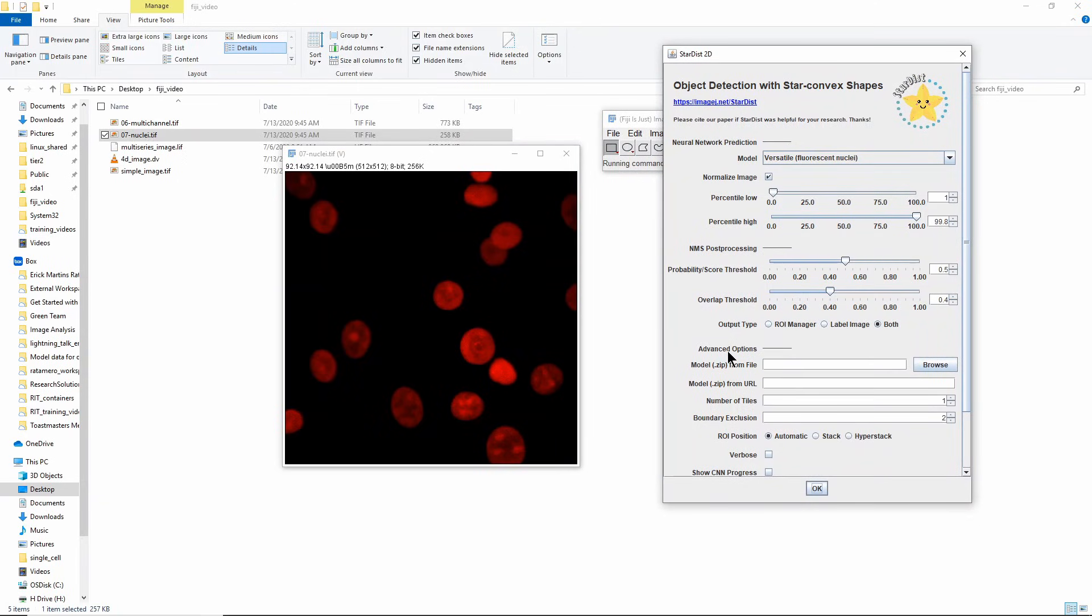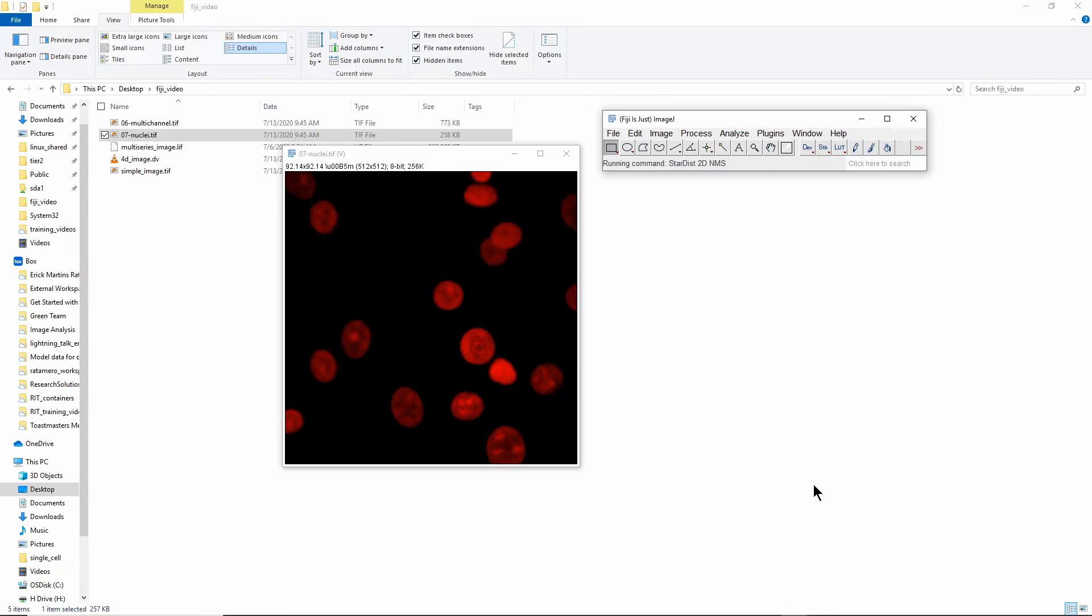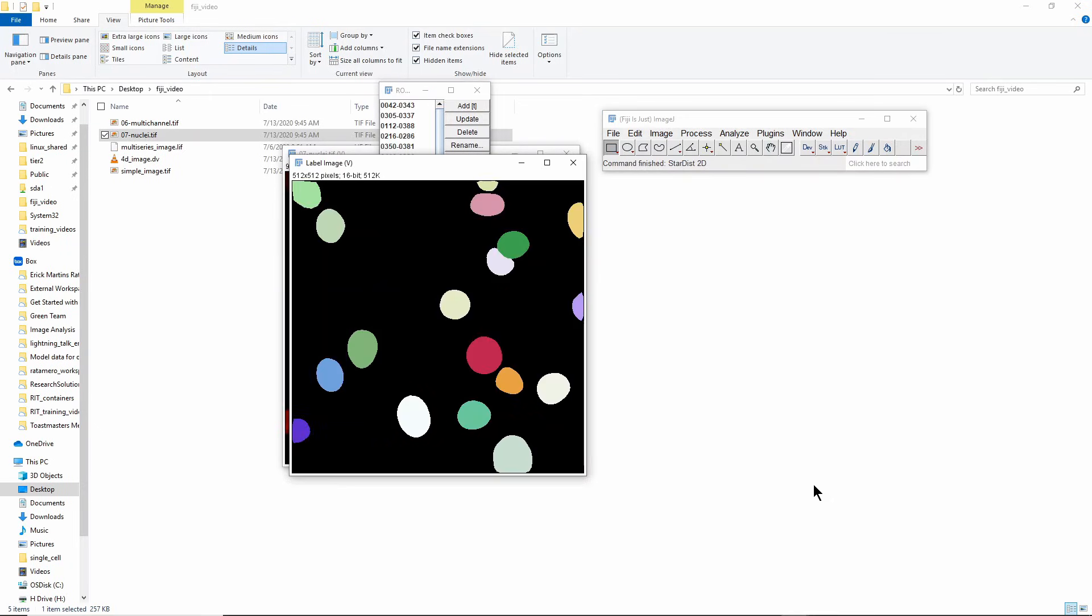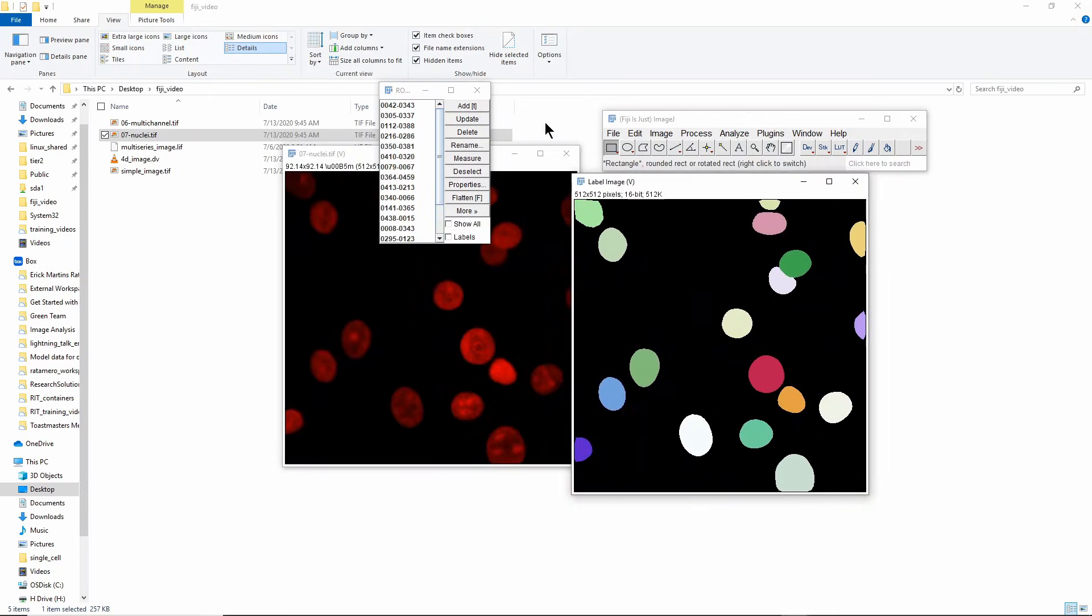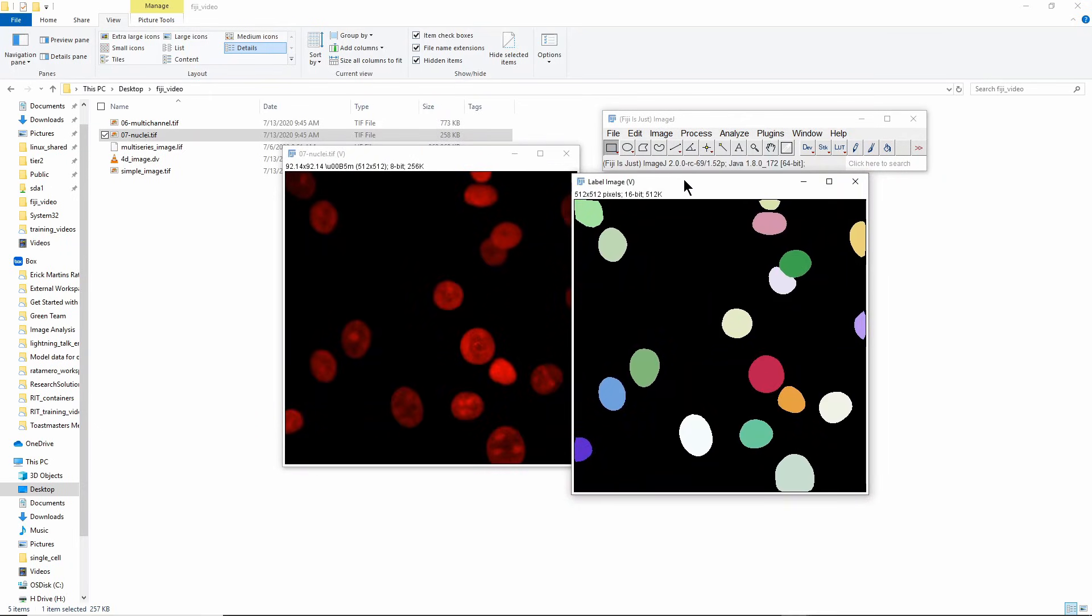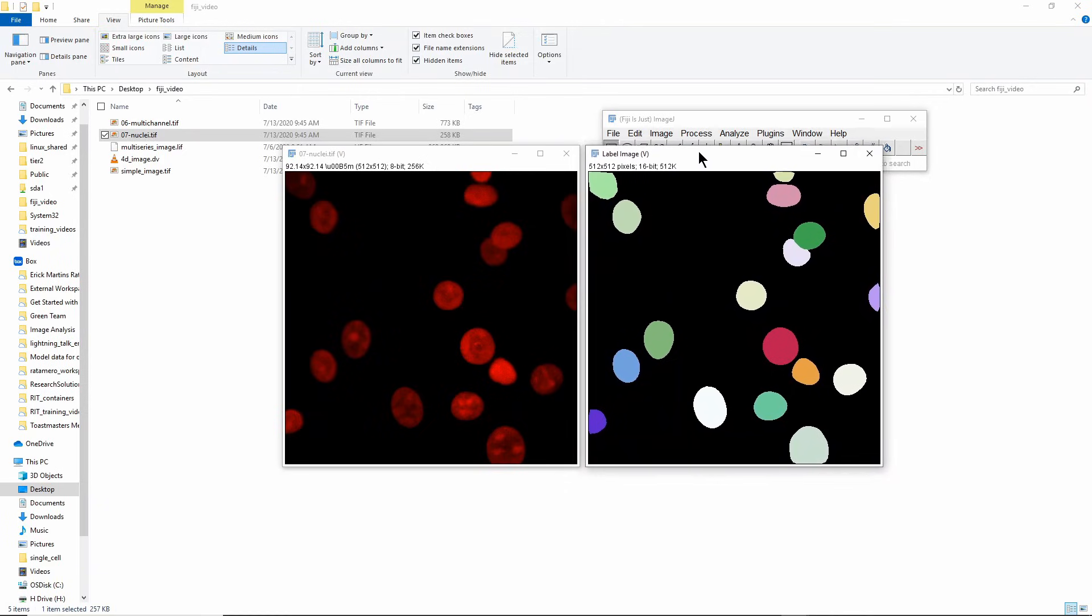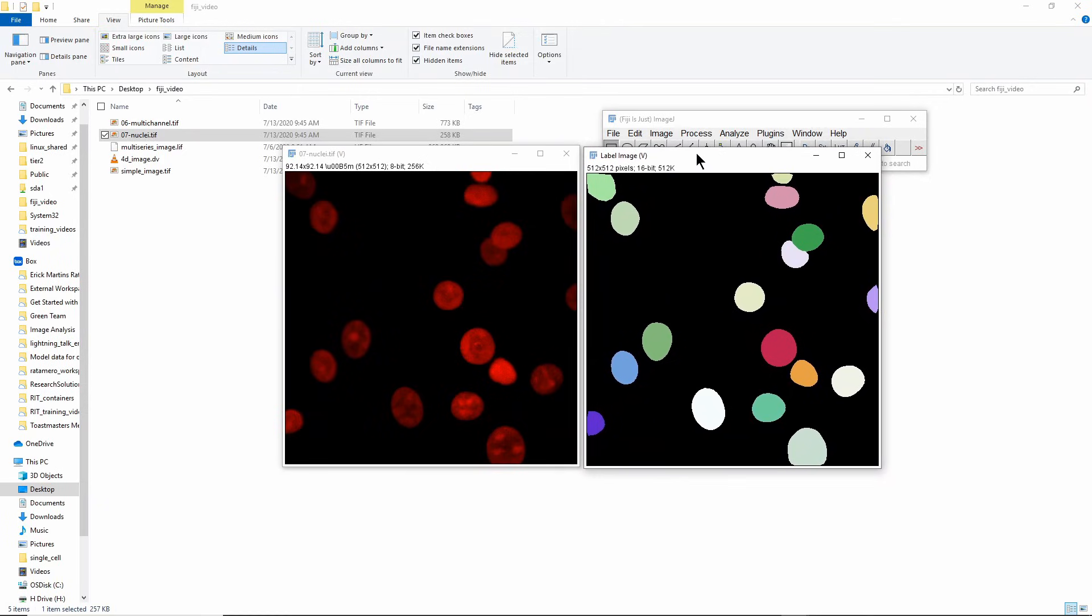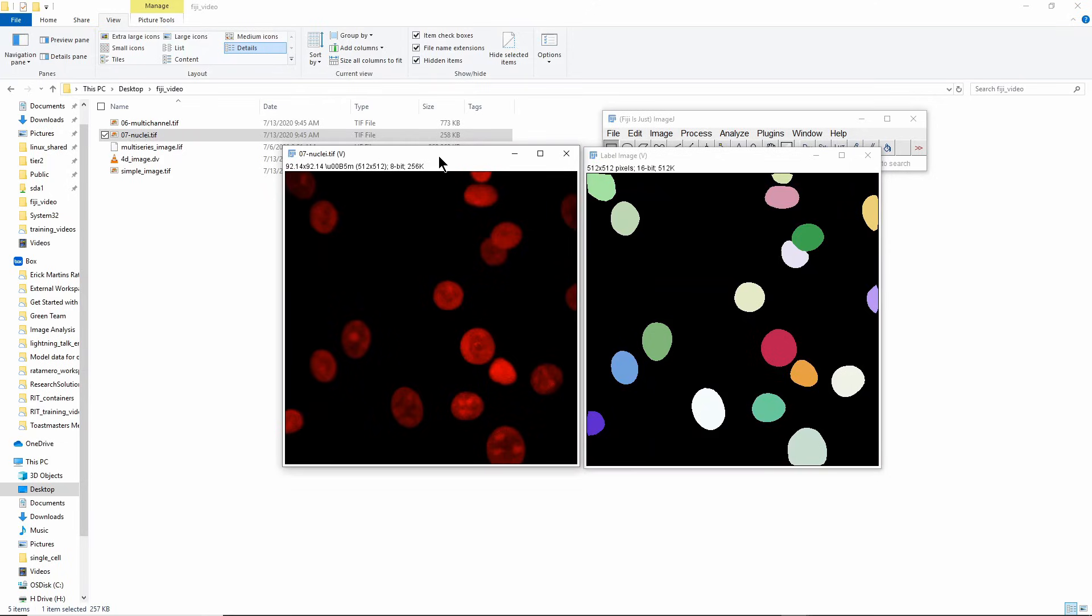If I go to Plugins > StarDist > StarDist 2D, I have not changed any of these settings here, this is exactly what comes from the default. I will just press OK and you'll see that it does a pretty good job of doing the same thing that we were trying to do by hand. These two are much more well separated, these two have a much more well-defined border than the straight border they had before, and it has detected everything else just fine. So this is the power of deep learning working for you.